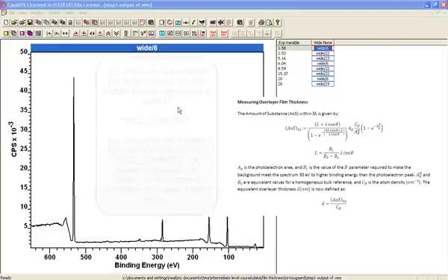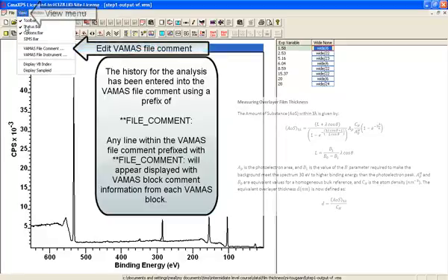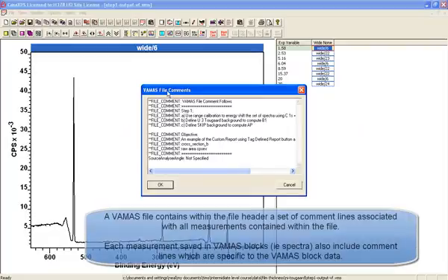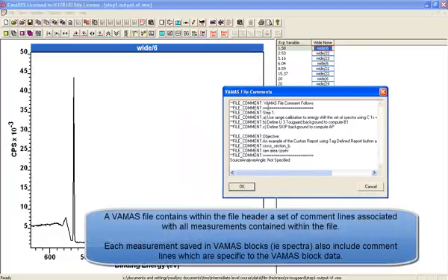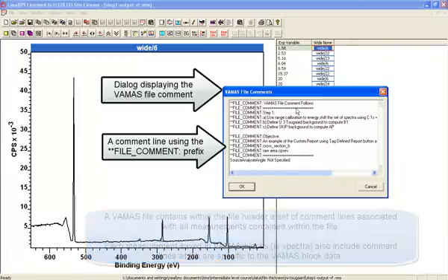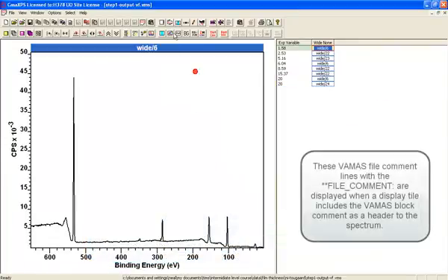This file has been prepared for calculating a film thickness based on these survey spectra. If we go to the VAMAS comment, you can see that we've included in the comment a set of lines that will be displayed when we display the VAMAS block comment.